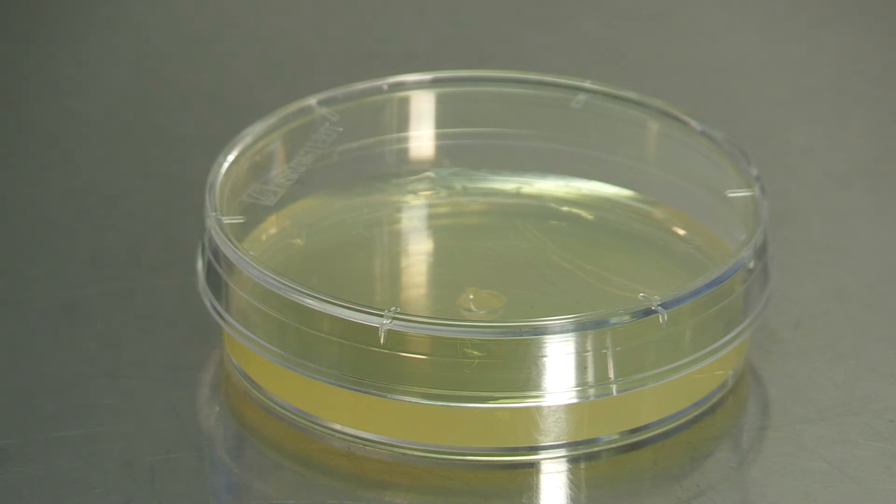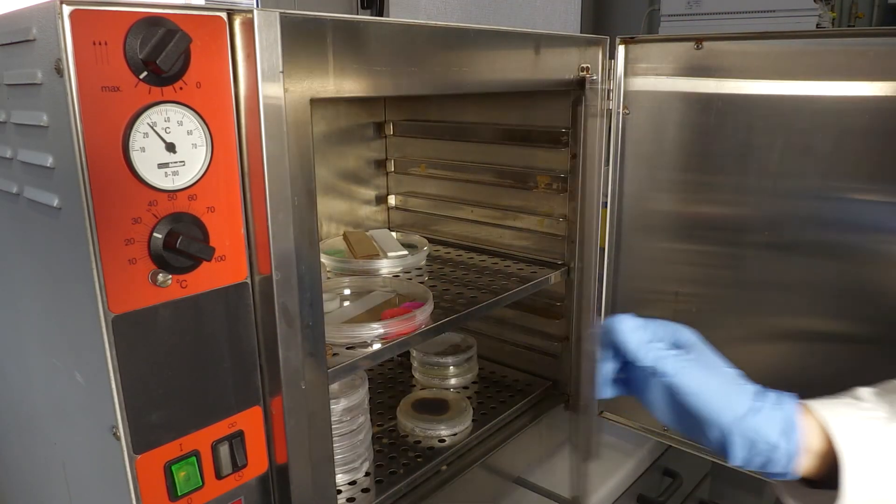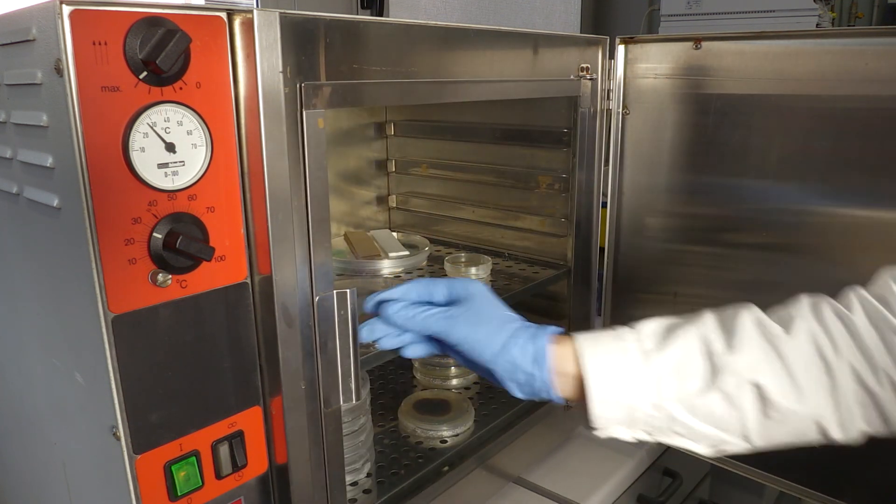The Petri is then sealed and incubated at 27 degrees Celsius for a time period depending on the microorganism species selected for experimentation.